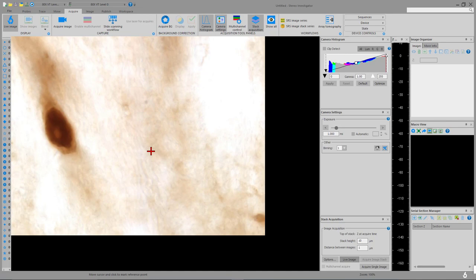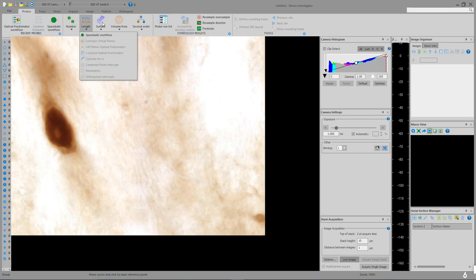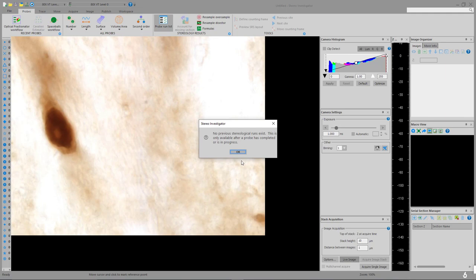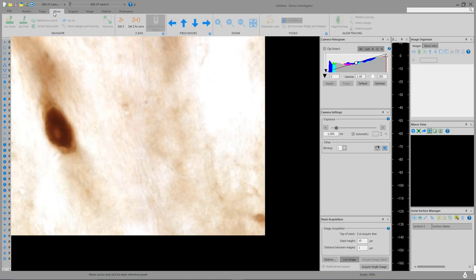We've got an image up on the screen and we're ready to begin the Optical Fractionator workflow. Let's briefly introduce the interface. We've got the Acquire tab. Moving to the left, we have the Probes tab — these are the probes to run Stereo Investigator, organized by what you're looking for. If you're looking for a number, click on that and you'll see the Optical Fractionator or Physical Fractionator. You also have the probe run list where you get your data. The Trace tab is where you go to trace something, the Move tab is for moving around, and Acquire is for acquiring and adjusting the live image.